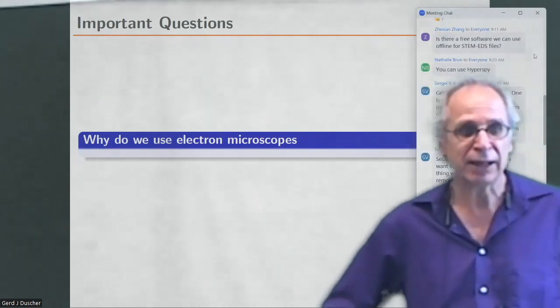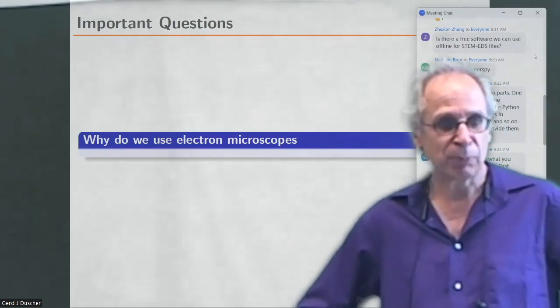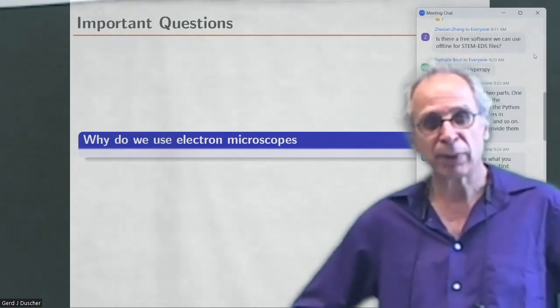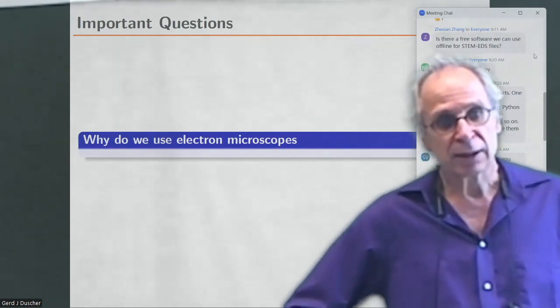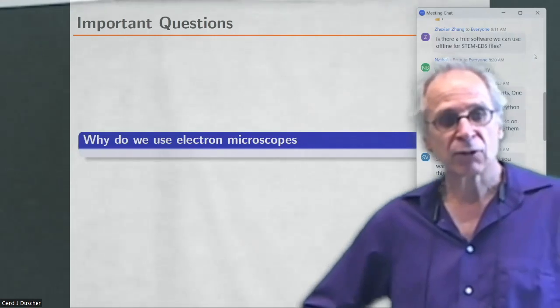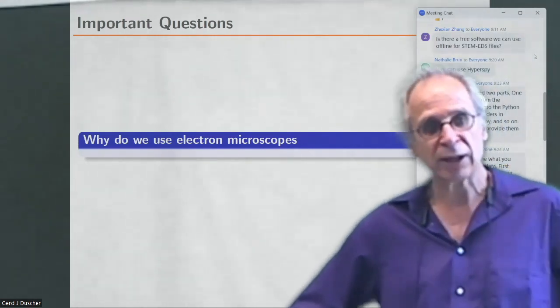Yeah, STEM EDS. You can use hyperspy in microscopy. I'm working on that, so we already can read all the EDS spectrum images and EDS spectra.